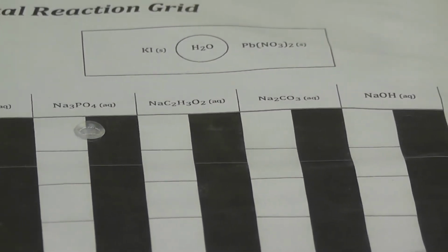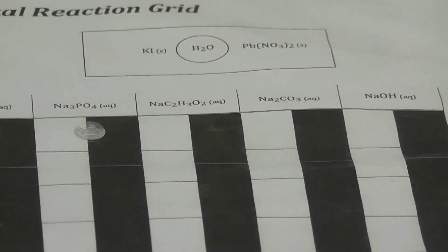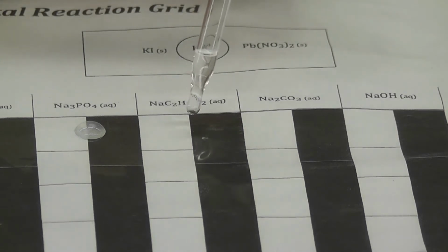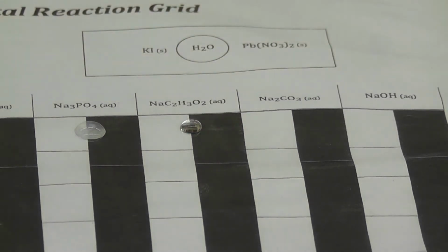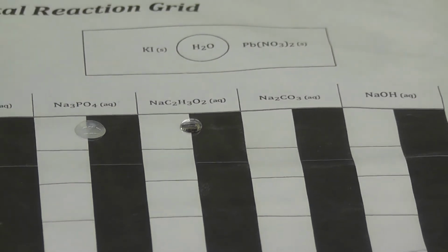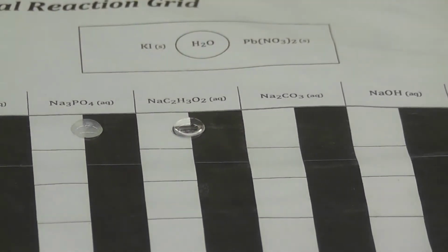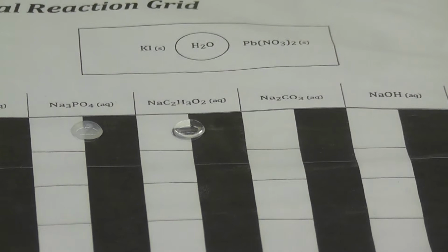Put that over here. Correct? This is sodium acetate? Yes. Okay. So, we put the 1 drop of lead-2 nitrate in between the black and white. And now we add the sodium acetate. One drop. Okay. So observe what happened there.